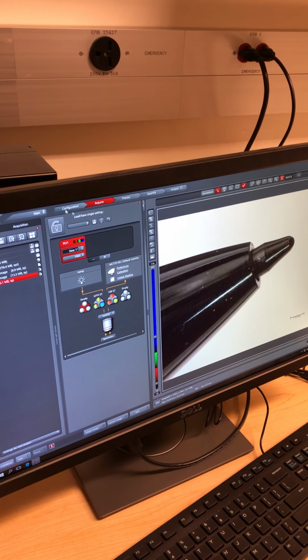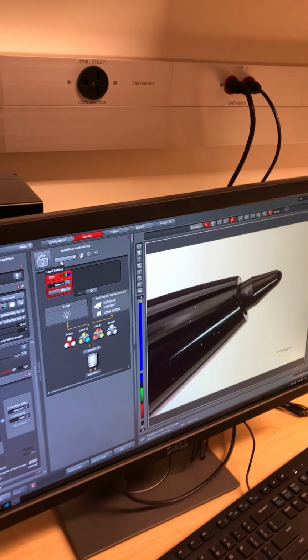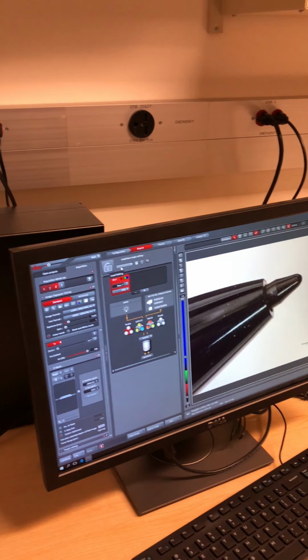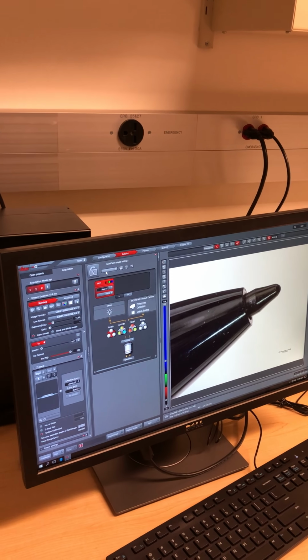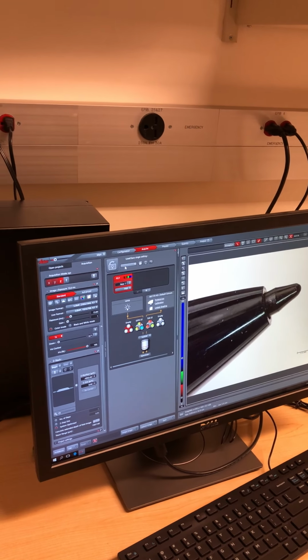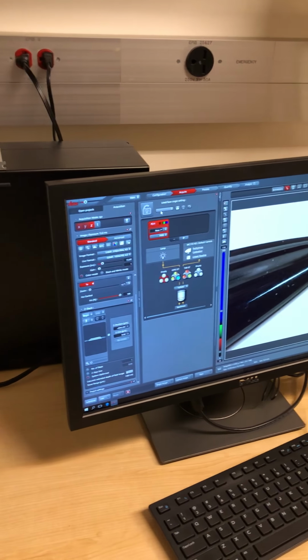Right. Okay. So if I want to look at stuff on my computer, just use ImageJ or Fiji. They'll convert to TIFF or JPEG or whatever. Fiji, for instance, will fully convert it. All of the scaling will be correct. Will this guy spit it out as TIFFs or whatever? You can. I mean, I wouldn't do that because once it's TIFF, you lose all the scaling info.